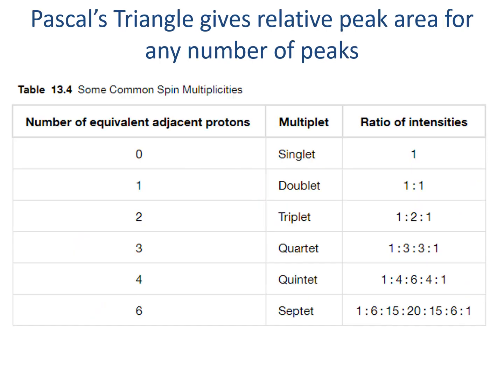The ratio of peak integrations that we'd actually see is predictable, as the peaks are going to overlap in the same way that Pascal's triangle is built up. In Pascal's triangle, each new entry is the sum of the 2 values above, with the outermost values always being 1. So if we look at 1 to 2 to 1, we'd say the 1 and the 2 add together to make 3. The 1 to 2 ratio again sums to make 3, and the outermost value is 1. And we can continue that down the triangle.